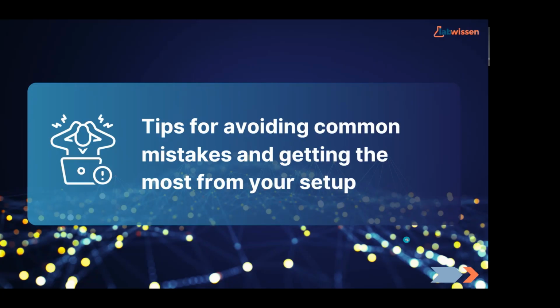Okay, so tips for avoiding common mistakes and getting the most from your setup. Just a couple of slides here with some tips.